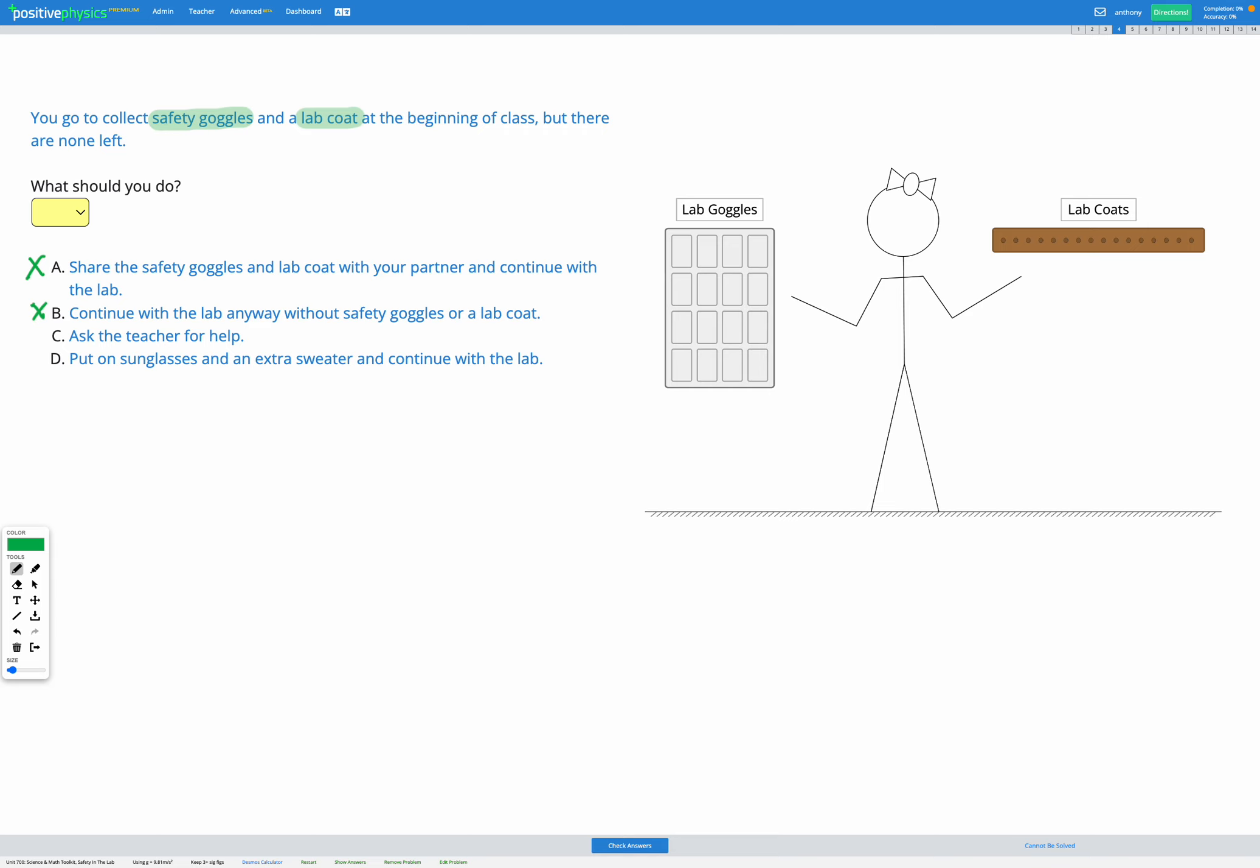So asking your teacher for help is always going to be the best option when you don't know what to do and when there's no obvious path forward, especially when it comes to safety. So ask the teacher for help. That sounds like a good option.